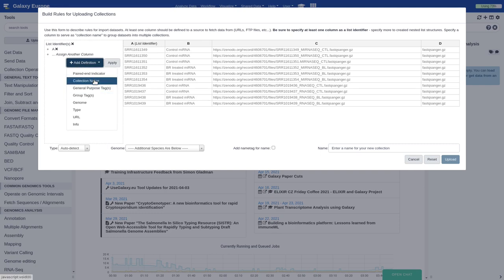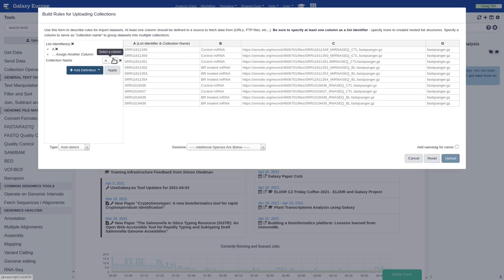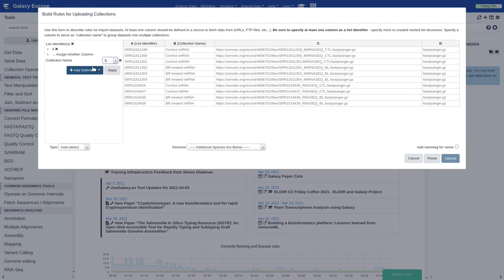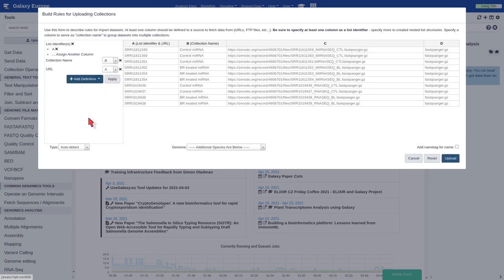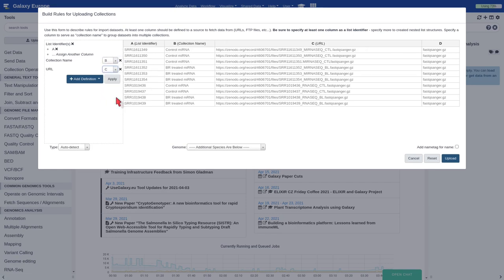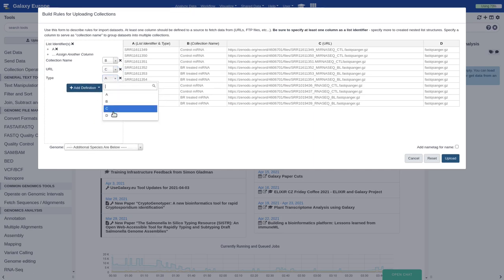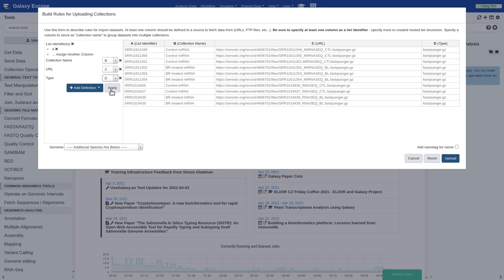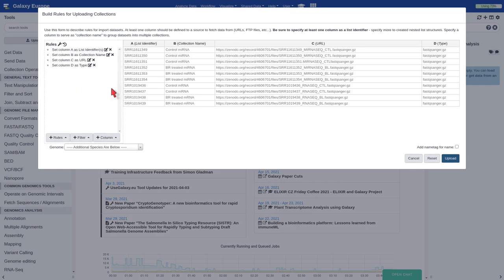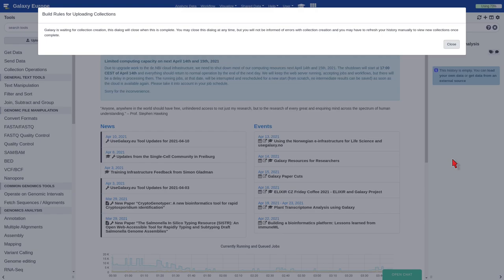Now, add definition, collection name, and select column B. After that, select URL and column C. And finally, add definition, type and select column D. Now apply, and finally, upload.